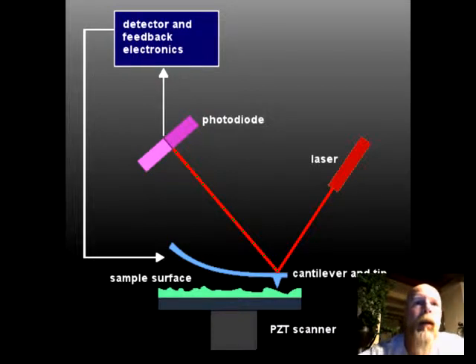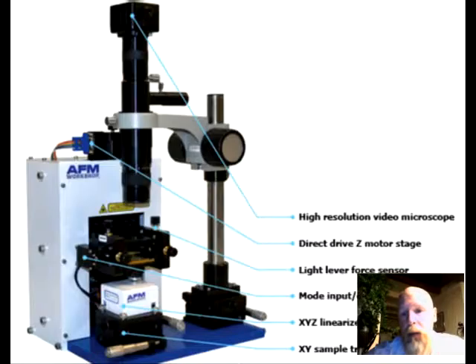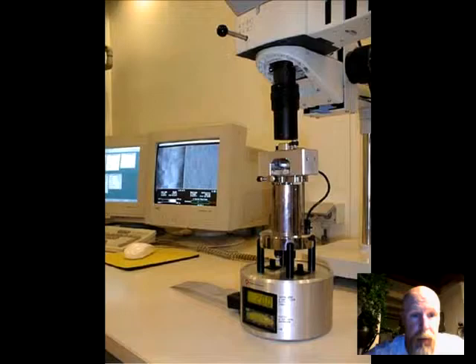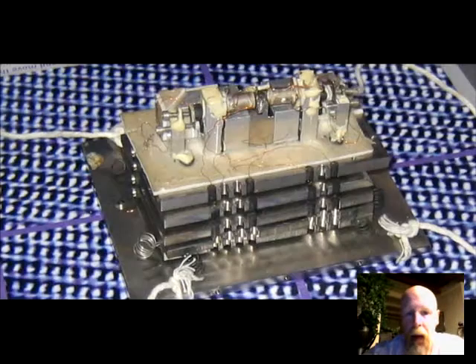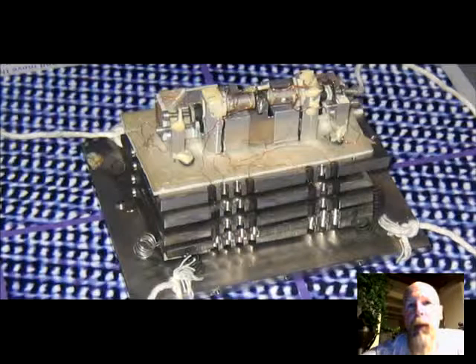So on our next slide here, I'm going to give you guys a little history. This is the first atomic force microscope ever produced. Quite a contrast compared to today's AFMs, basically like this image or in this image. But this was, like I said, the first AFM created. It was created by Gerd Binnig, Calvin Quate, and Christoph Gerber in 1986. It was developed in an attempt to image non-conducting samples with atomic resolution.